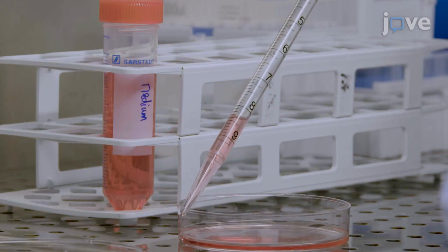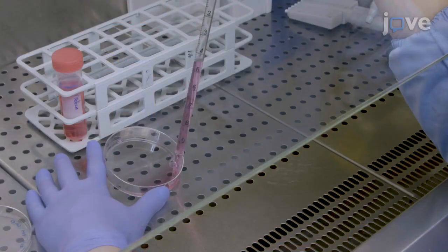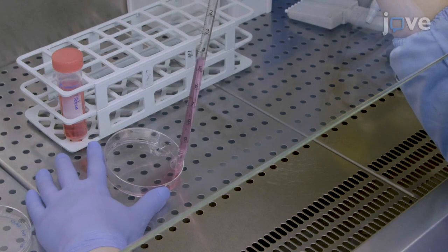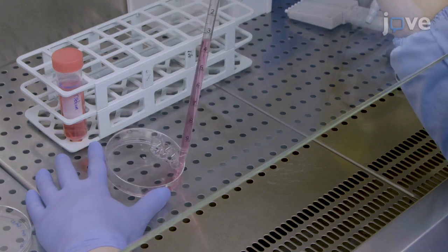After incubation for 5 minutes, add 8 ml of EB differentiation medium to the dish. To dissociate the MESC colonies to obtain a single-cell suspension, pipette the medium up and down 15 to 20 times and transfer the suspension to a 10 ml tube.